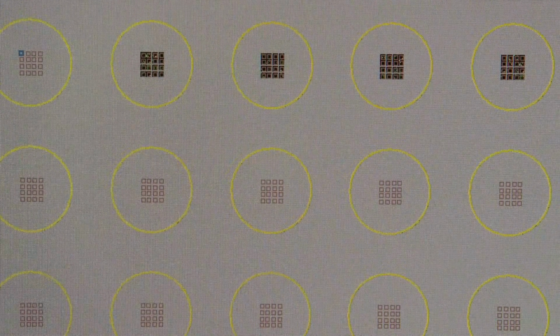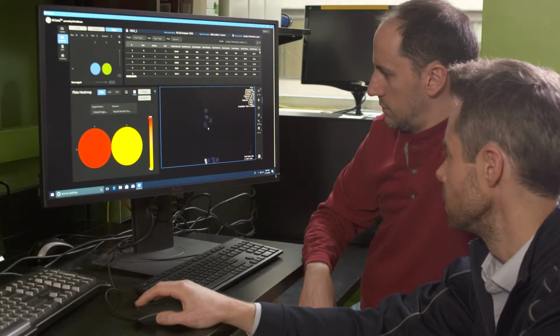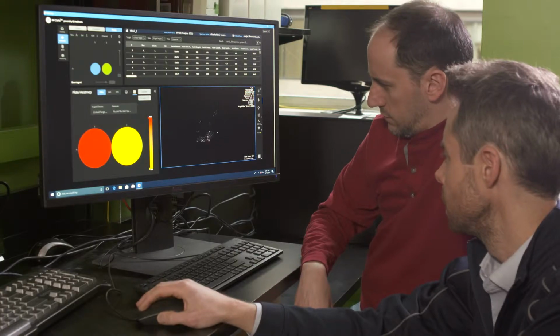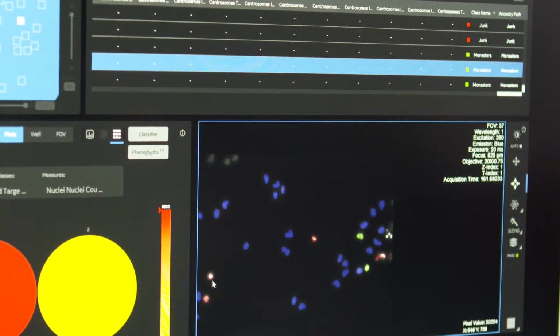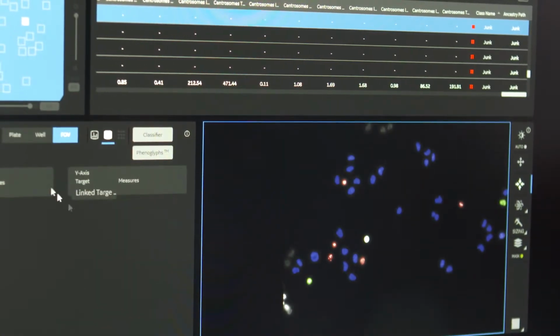Analyzing large image data sets can be complex and labor-intensive, but GE Healthcare Life Sciences can help. Their InCarta image analysis software with Phenoglyphs machine learning classification simplifies cellular phenotyping from high-content screen data to greatly improve efficiency, accuracy, and ultimately speed to results.